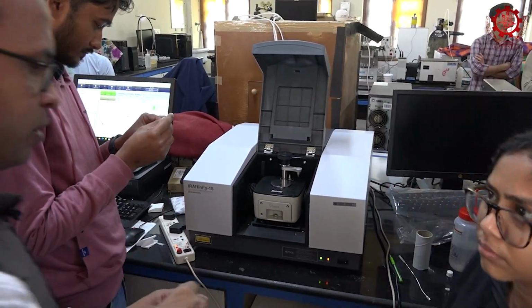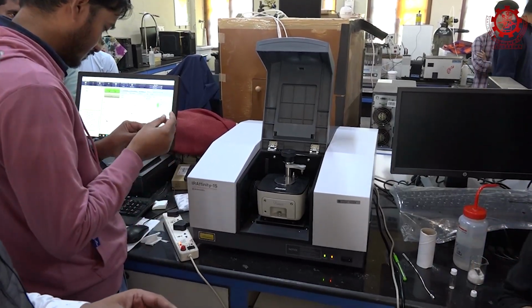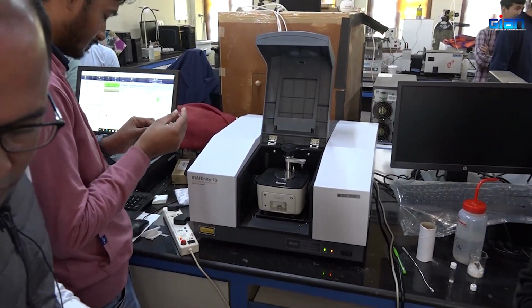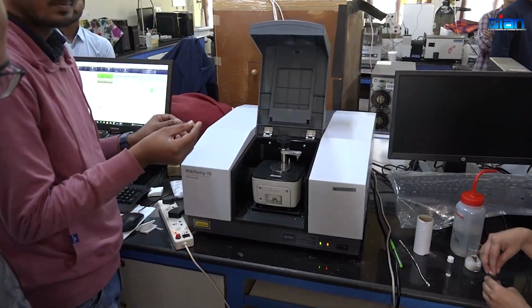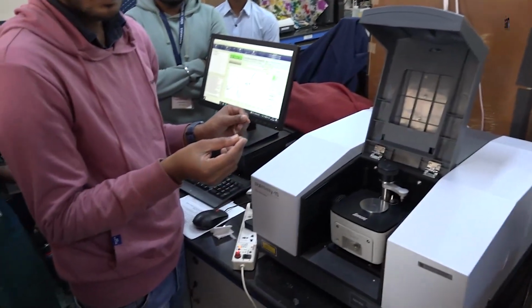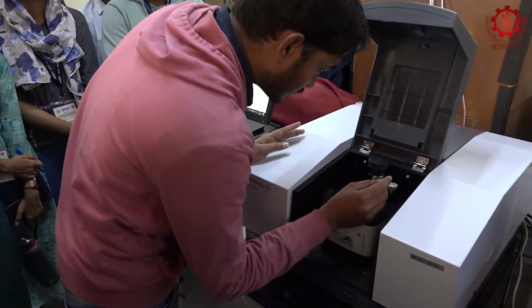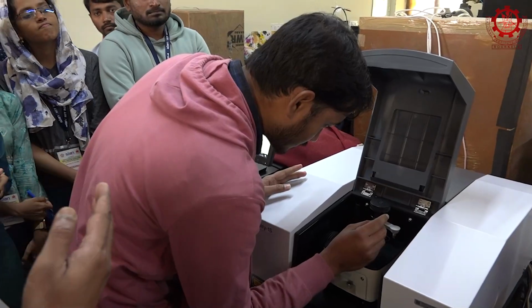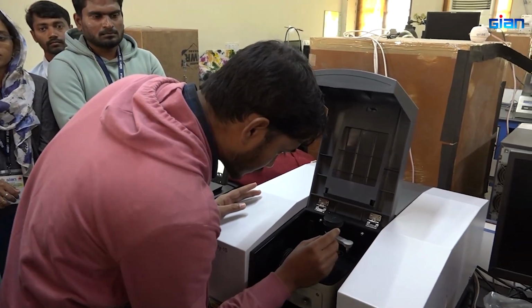Okay, maybe you can move it a little to that side, just a little, because then I can accommodate here so that everybody can see. Yeah. Okay. So now there is a place where the IR radiation will come. You can see there.